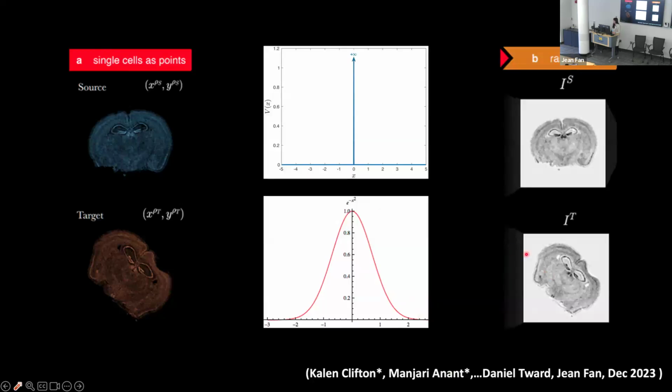So if we are creating this image representation at 30 micron resolution, that means if you have a structure that is smaller than 30 microns, it becomes a blur. So for example, consider my hand. If I'm creating an image at a blurry resolution, I'll probably, for the most part, align whether it's on my hand or off my hand, but my fingers might not be perfectly aligned.